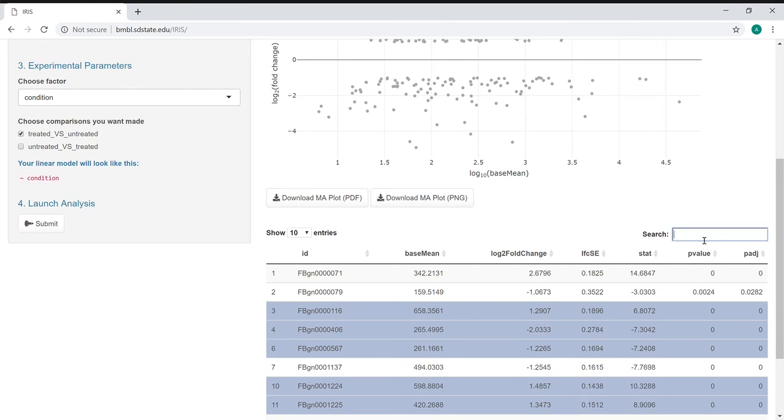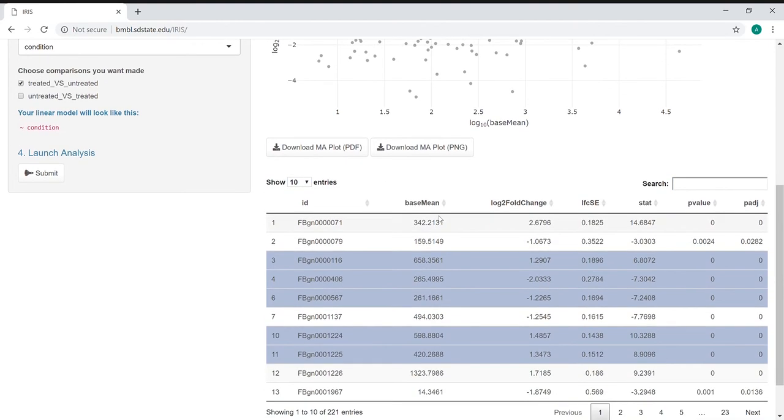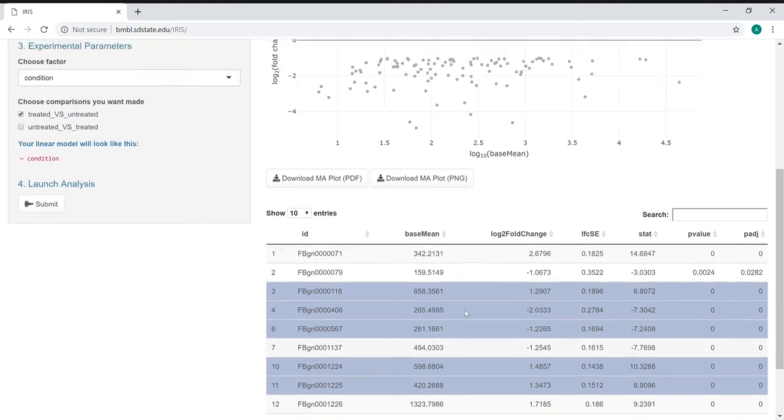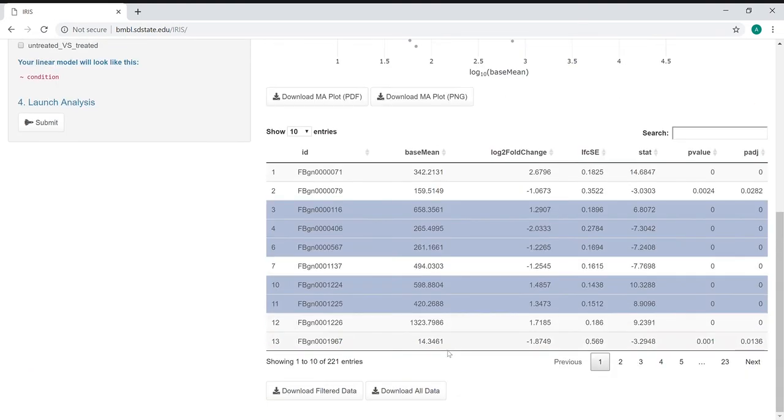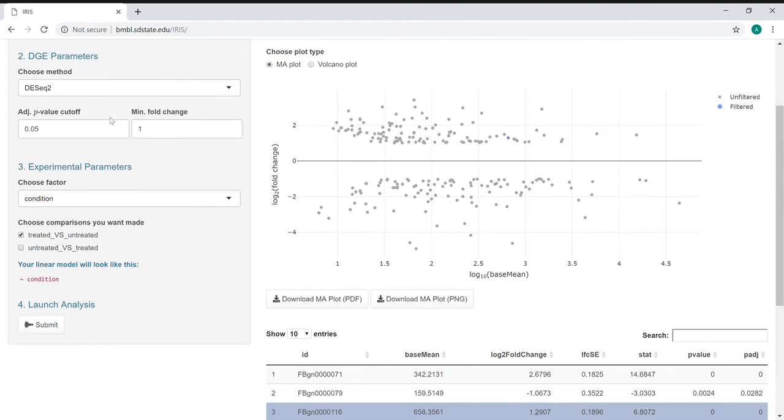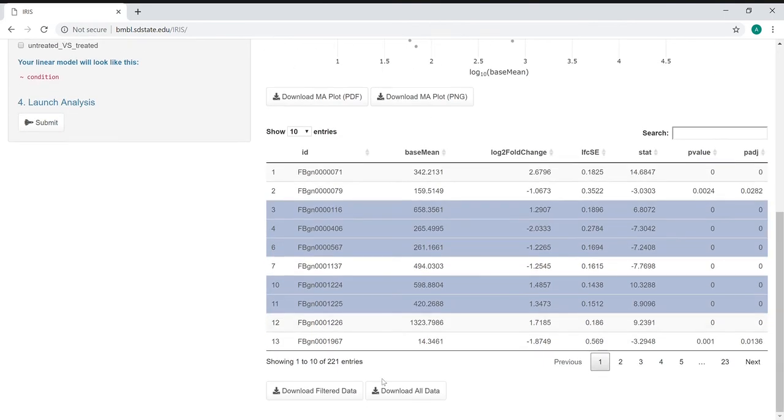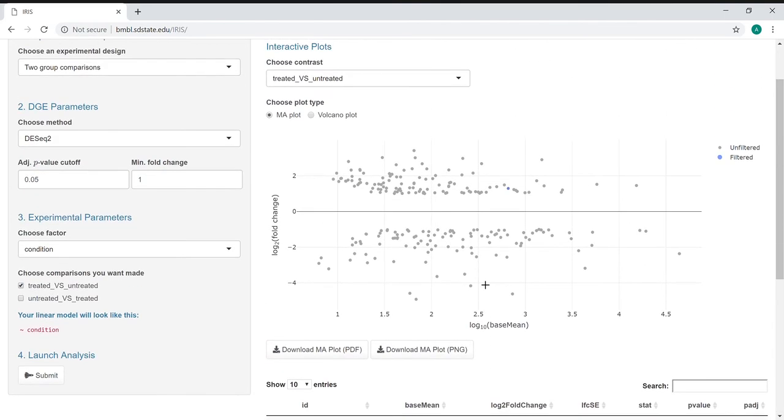We can also search for particular gene IDs. If there's a gene that you're interested in, you can search here or expand this to up to 100 entries to look at the connectivity between these two. This table is also downloadable and you can download either the filtered format based on these cutoffs or the entire data.